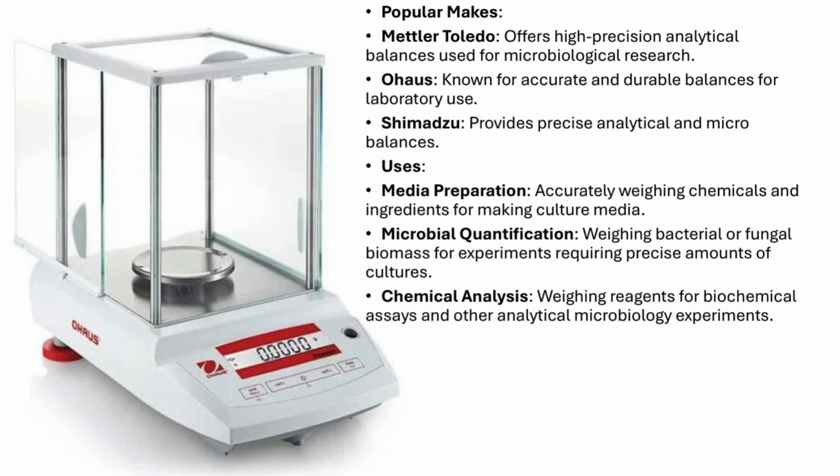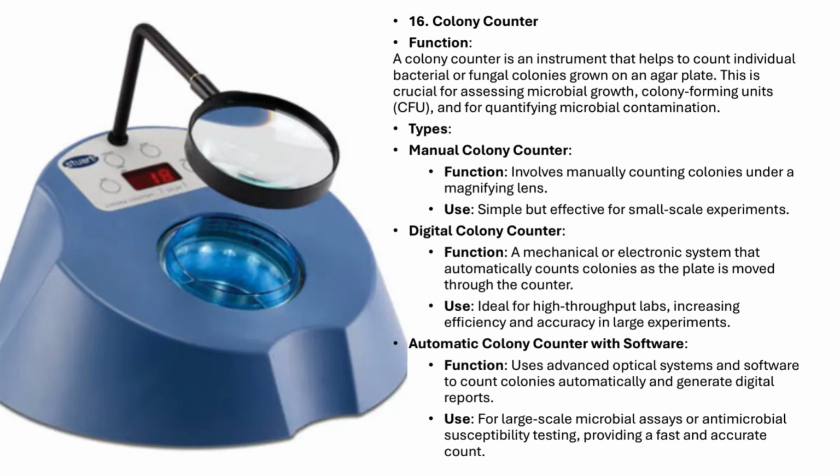Colony counter, quantifying microbial growth. Next up, we have the colony counter, a vital tool in any microbiology lab for counting bacterial or fungal colonies grown on agar plates. Accurate colony counting is essential for assessing microbial growth, determining colony-forming units, CFU, and quantifying microbial contamination in various samples.